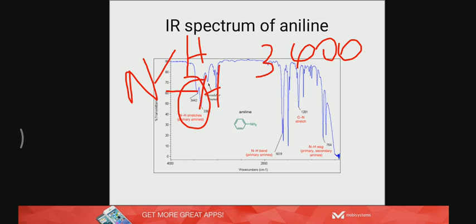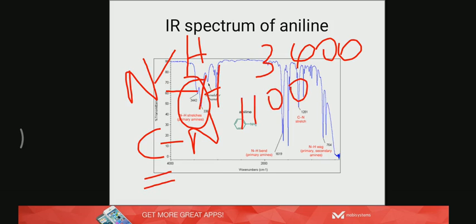And another characterizing peak of amine is C single bond N, which is not very significant, anyway not very noticeable. It comes again just around 1100. And finally there is aromatic CH stretching, right? That comes just above 3000 centimeter inverse.